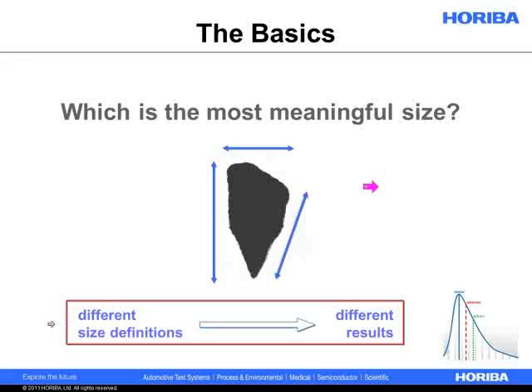And here's one of the key takeaways I hope you get from today's presentation, which is different size definitions lead to different results. Right? And this is especially true when comparing different technologies. I'm going to focus most on laser diffraction as a technology for today's presentation, but there's a huge range of different technologies out there in the world, some more common than others, and most of them look at different aspects of the particles, which means that they're going to report different size definitions, which means they're going to report different size results.